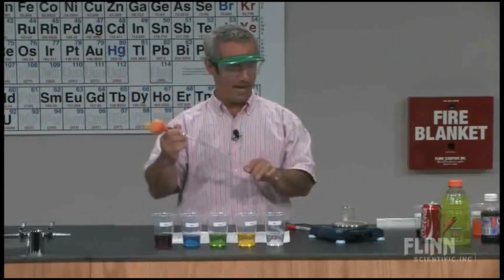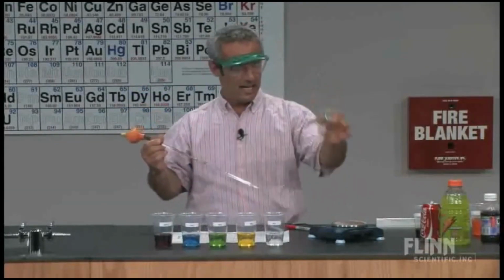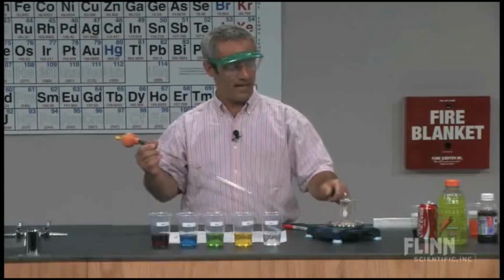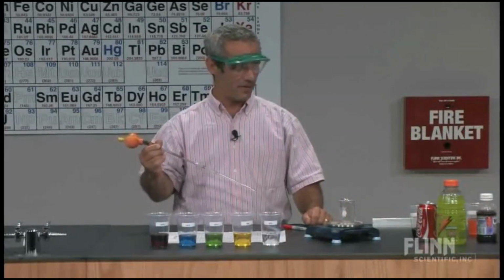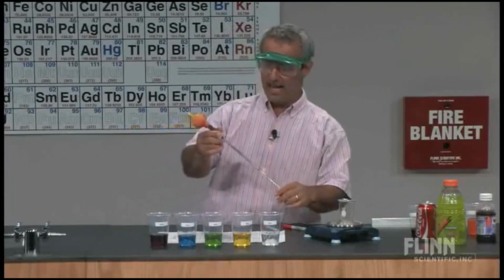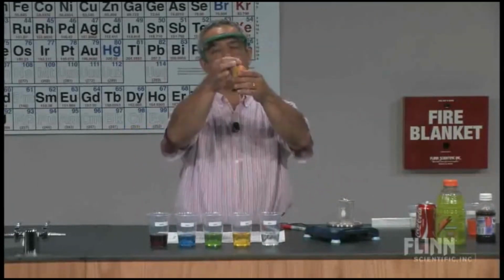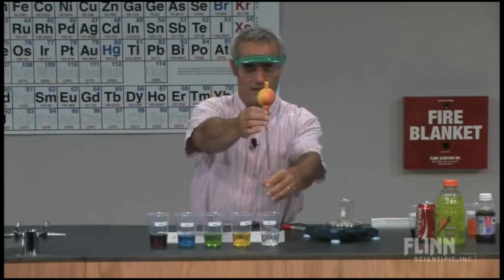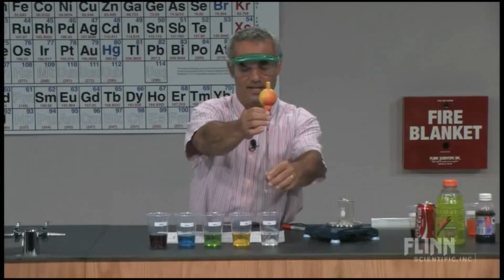So we're using a pipette bulb. And we're placing a 100 ml beaker on the scale and zeroing it, okay? Pushing the tare button. So the scale right now, of course, reads 0.00. And we're going to first create a little vacuum in there. And I'm going to draw up into this pipette.